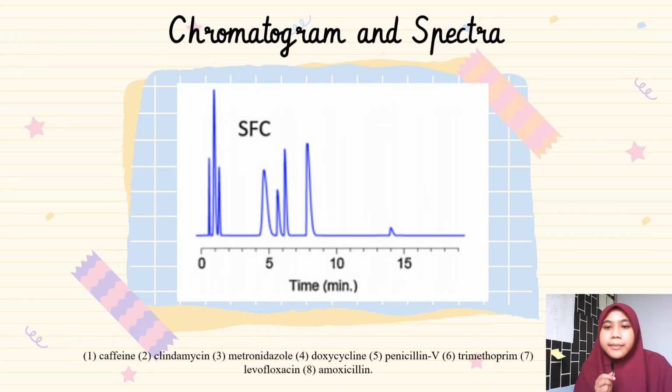From the extraction that Maiza explained above, we can get the spectra of SFC as below.